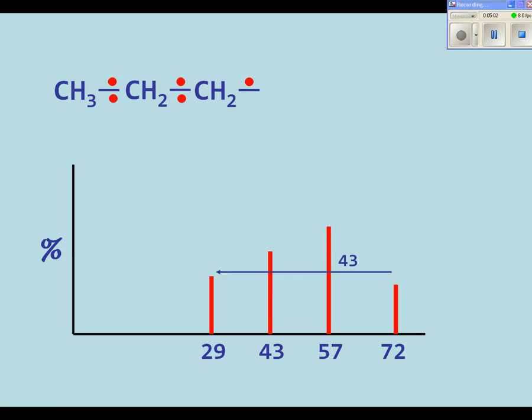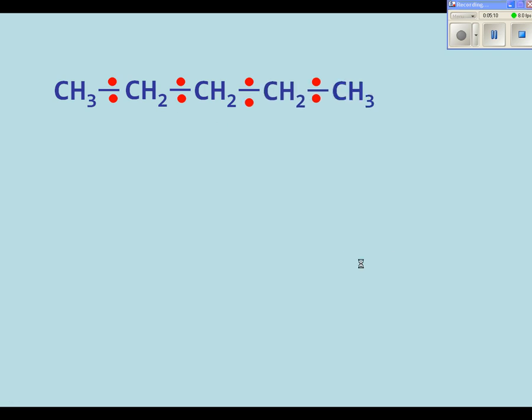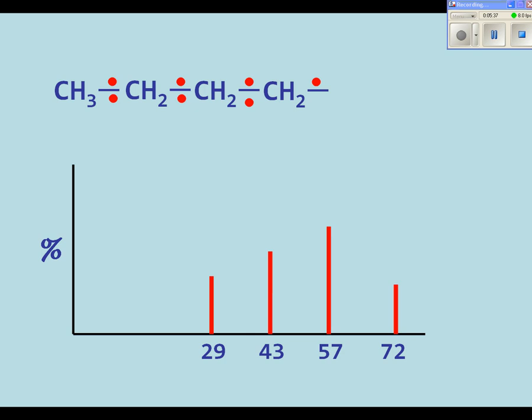Now what would be left behind would be a molecular fragment, the propyl fragment, which has a molecular weight of 43. And finally, electron bombardment of the first bond could cause a butyl radical to be left behind, but a methyl ion to form. So this time the electron remains with the butyl part, and the methyl ion that forms with a molecular weight of 15 would then be accelerated through to the next part, eventually being detected on the detector. And so what we'd have is a graph showing the appearance of the peak at 15, representing the methyl group.